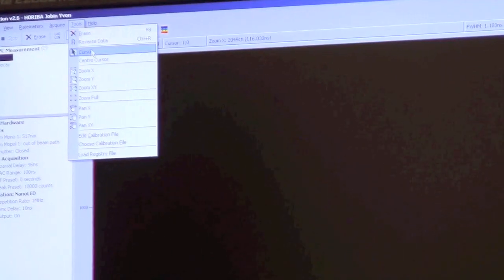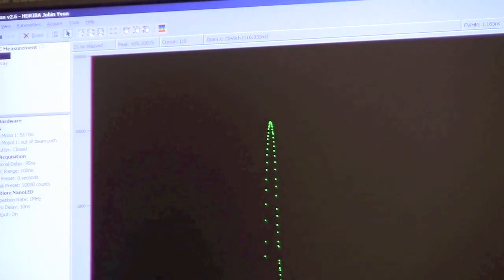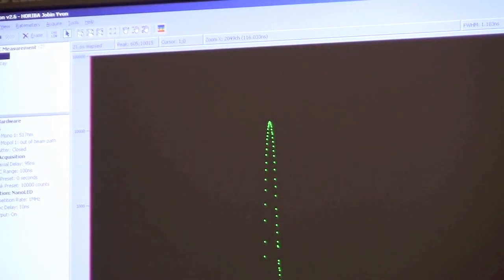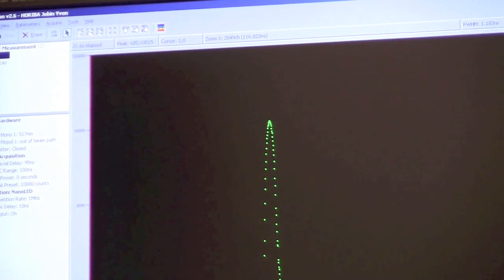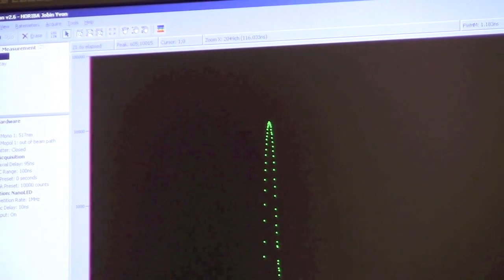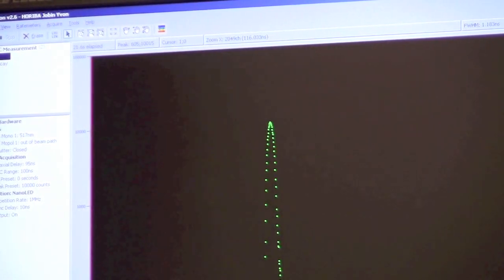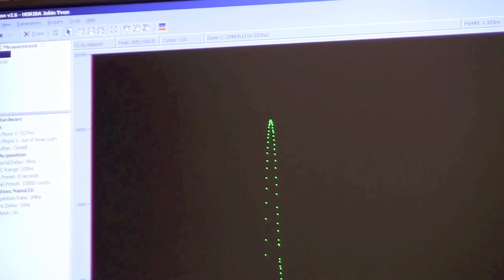We're going to switch our data so it looks normal. Now we can actually begin our measurements. Now we've measured the instrument response function, I can put in my Alexa 488 dye and measure the lifetime of 488.